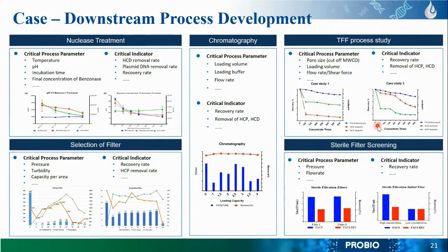And actually, these kinds of things will become the pillars of downstream processes. Ultrafiltration is the method of choice for concentration and diafiltration. For these particles, it will remove low molecular weight impurities and reduce the handling volume.